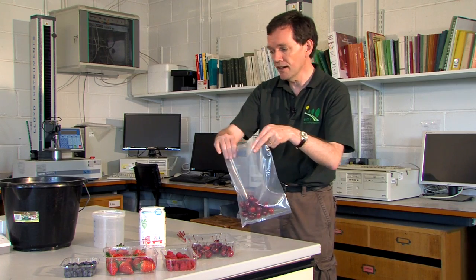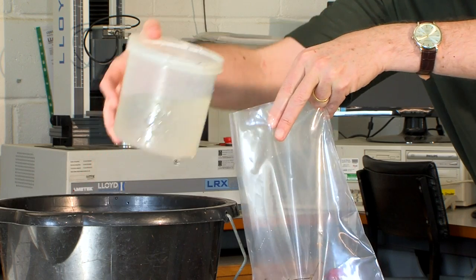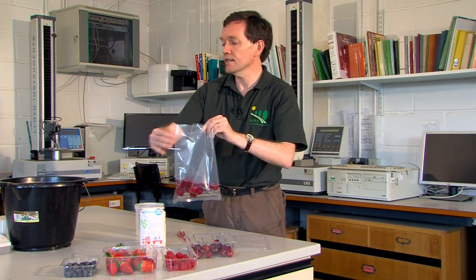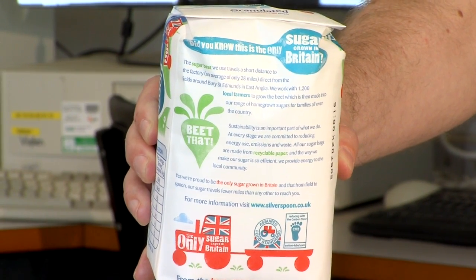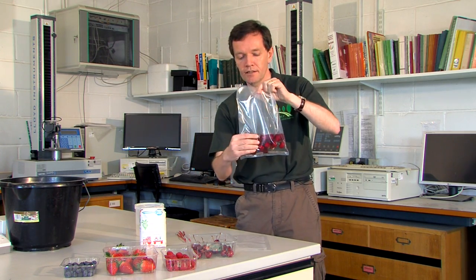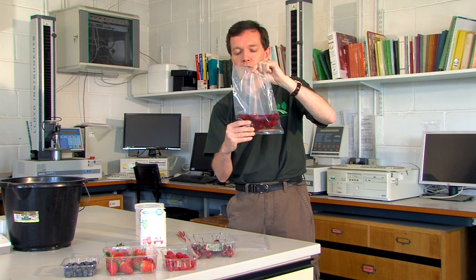So you place the fruit in the bag, add your sugar solution, just enough to cover the fruit. This is a simple solution of a small one kilogram bag of sugar from the supermarket and five and a half litres of water. You add your solution and you gently crush the fruit. You don't want to do this too firmly because you don't want to kill the larvae, you just want to release them into the solution.